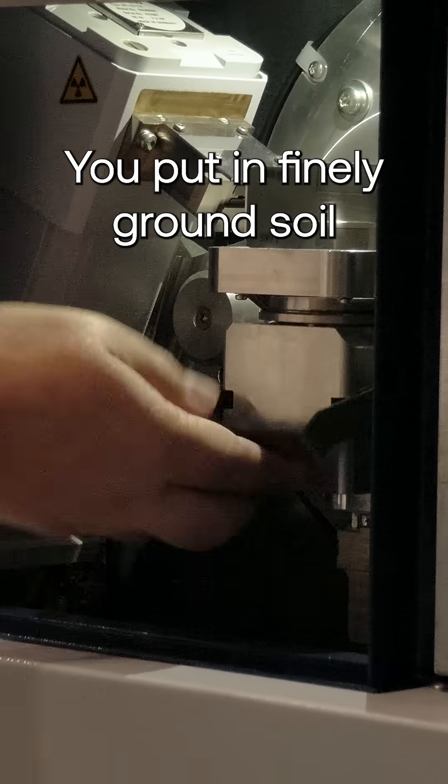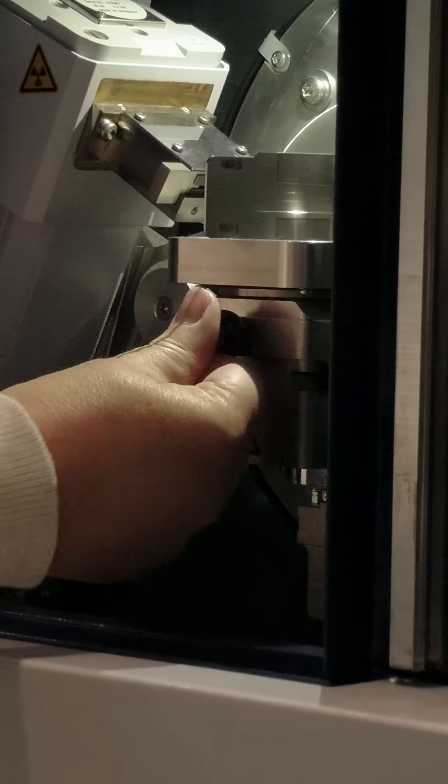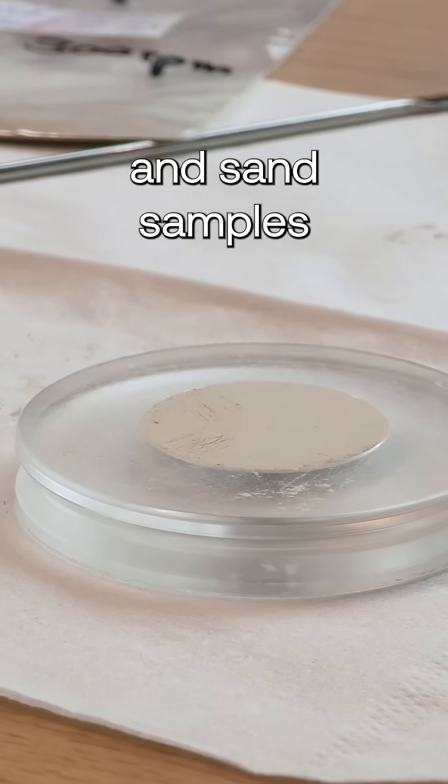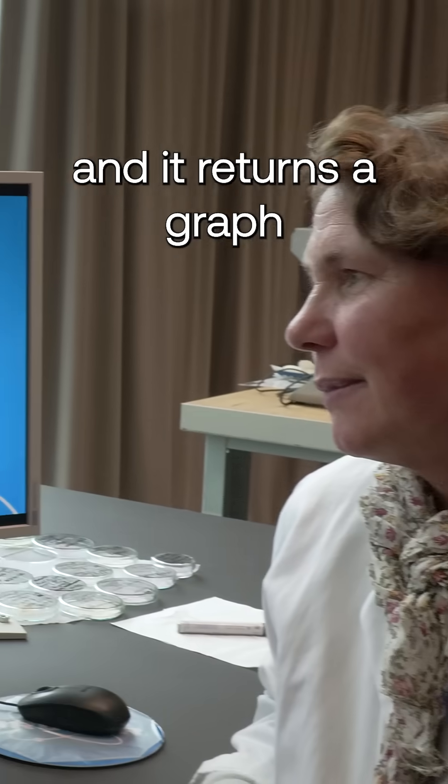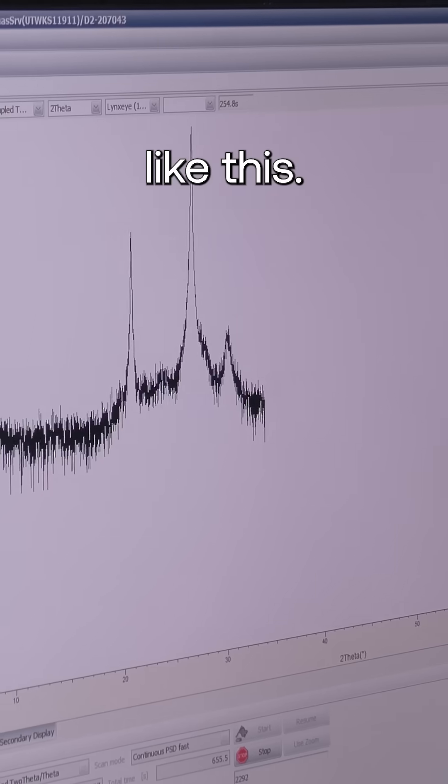You put in finely ground soil and sand samples, and it returns a graph like this.